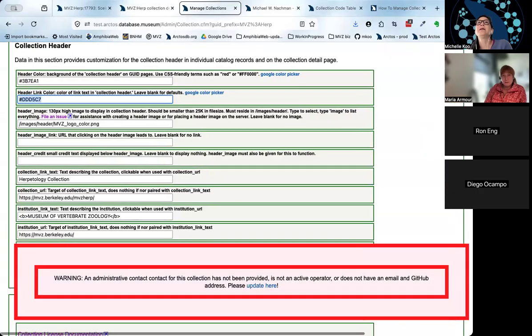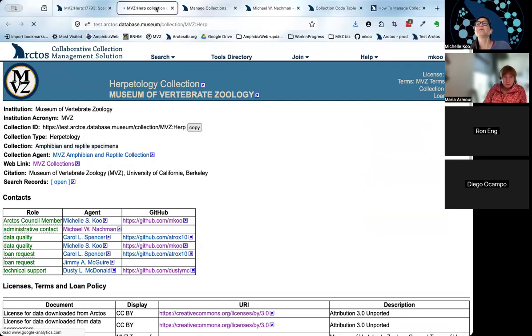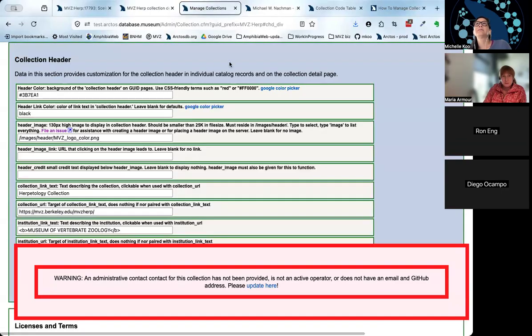Just change the term right here. Let's change it to black so you can see what that looks like. That'll at least set it to a default here. Oops, am I not in the... I think it needs a little... we've got some aggressive caching going on.